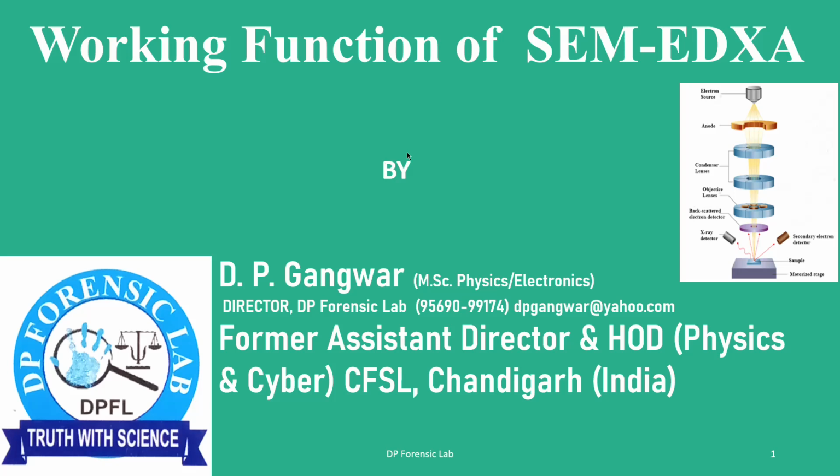Namaskar, my dear friend. I once again brought a very important video, working function of the SEM EDXA, scanning electron microscope, energy dispersive X-ray analyzer.